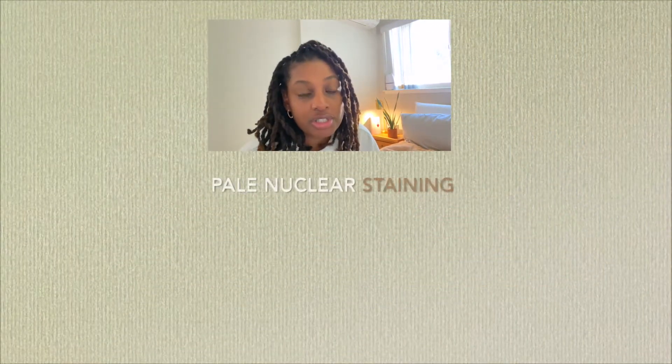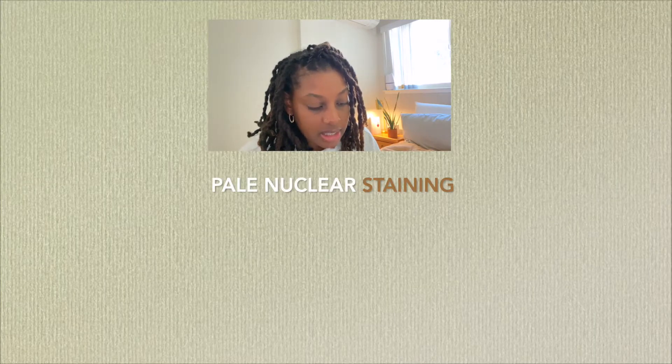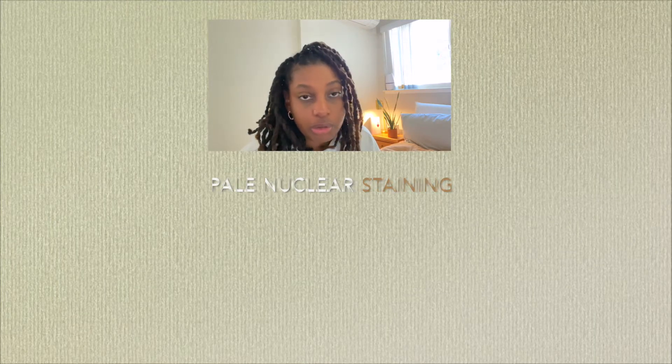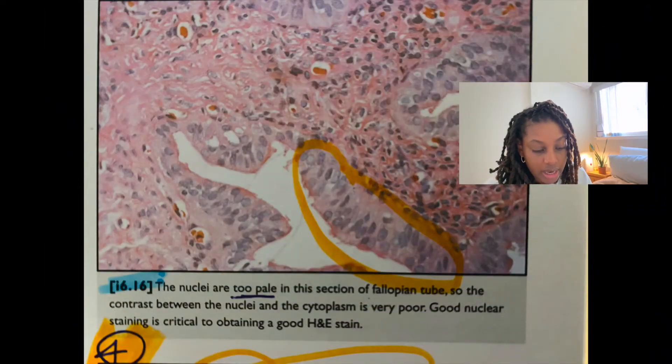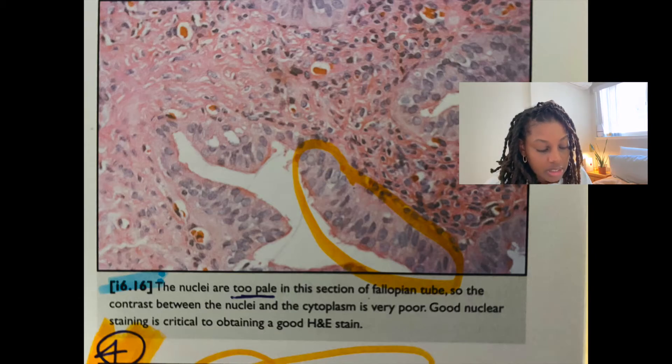Another really important H&E troubleshooting topic is pale nuclear staining — hematoxylin that is too light. The nuclei are too pale in the section, and the contrast between the nuclei and the cytoplasm is very poor. Good nuclear staining is critical to attaining a good H&E. Some causes include not leaving the slice in hematoxylin long enough, staining with over-oxidized or depleted hematoxylin, or over-differentiating the hematoxylin.